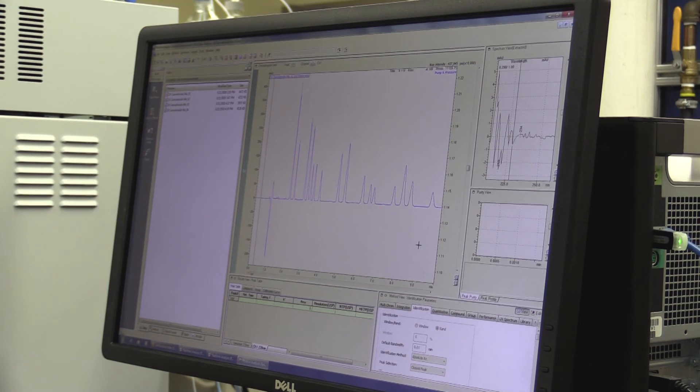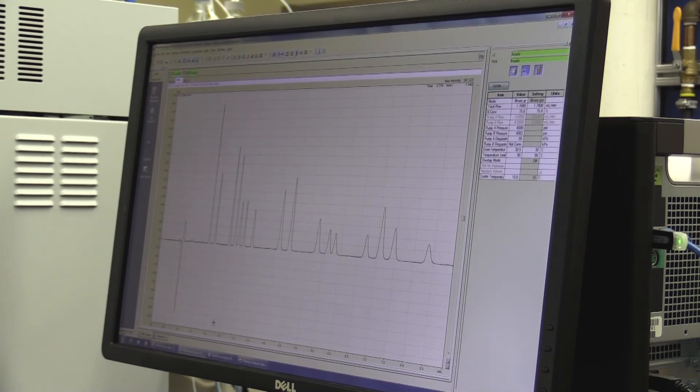All compounds are resolved in this fast nine-minute analysis, making the method suitable for high-throughput cannabis testing labs. In addition, this analysis uses a simple isocratic mobile phase that's easily transferable between instruments, compared to more complex methods that incorporate atypical mobile phase gradients or additives.